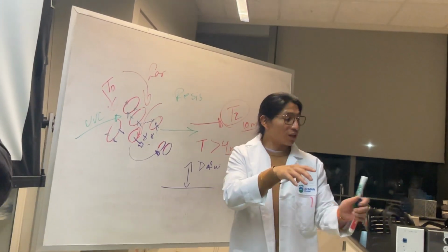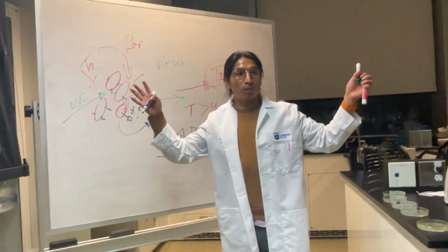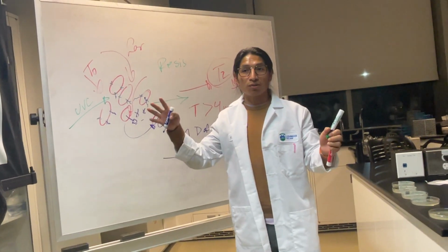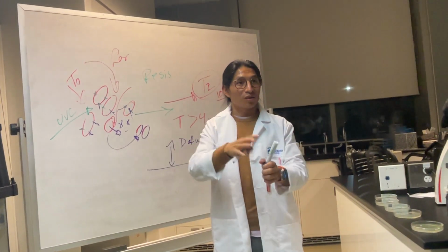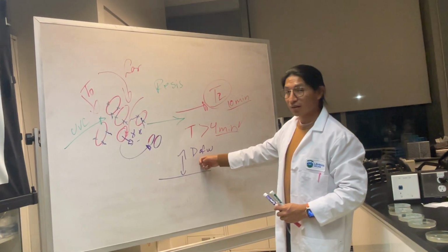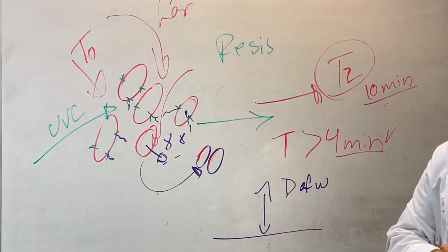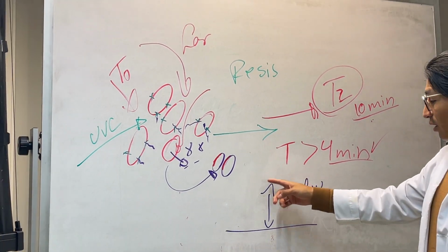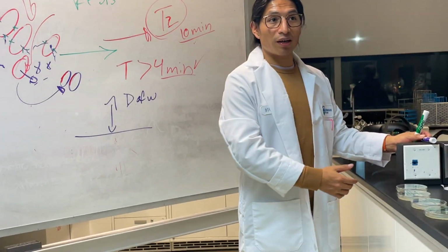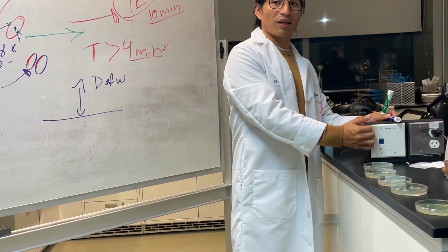So it can work exactly how it works in the microscope. Remember how both of them work as a relationship? Field of view, work distance. In this case, it could be very similar: distance plus exposure time, more or less, determines how the bacteria grow. So this is another way that you can think about this. If you notice this, you can add it in your discussion again. And do you remember what the distance was? It was like over this. Yeah. So I will take a ruler and measure it and say, this was my constant. Gotcha, yeah. This was my baseline at which I did it.